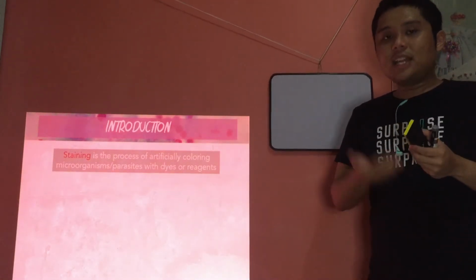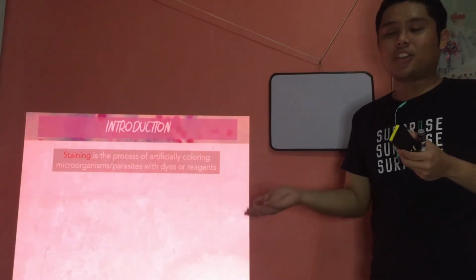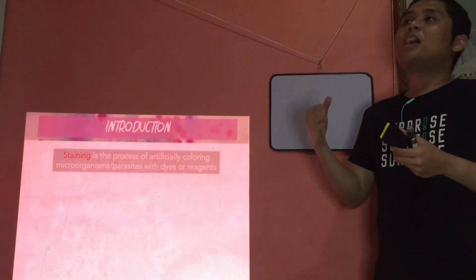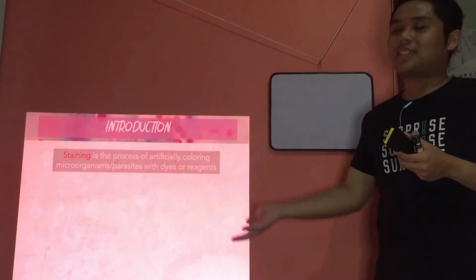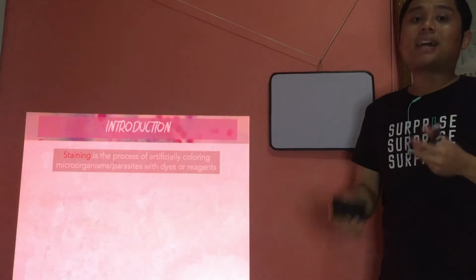But in routine laboratory in the Philippines, in the hospitals that I had my internship in, staining for parasites is not routinely performed. But I think in the US and other countries, they are performing it. That's why we're discussing it. But generally in the Philippine setting, the most routine is staining for bacteriology.